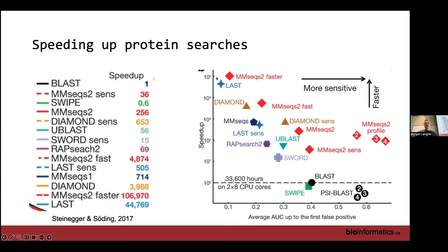Depending on how precise you want to be, you could choose the database. You can imagine that UNIREF 100 would obviously be a lot larger than UNIREF 90 or 50. UNIREF 50 would be a lot smaller, but obviously then you're possibly collapsing different genes. It seems like the trade-off often lands around UNIREF 90, and I see a lot of people use it. I think there are actually other cutoffs between 90 and 50, but you can imagine just choosing one of those. Usually, because the size of UNIREF 100 is so large, people often don't go for that one.